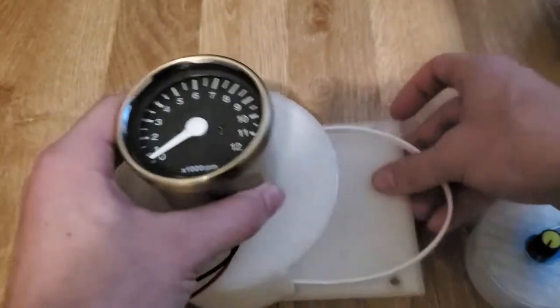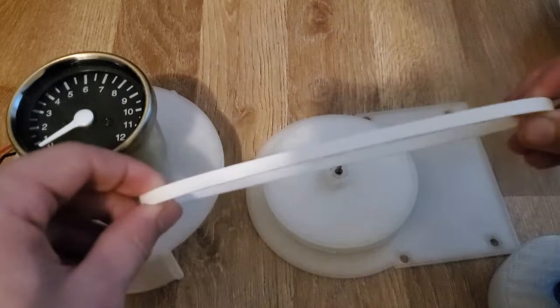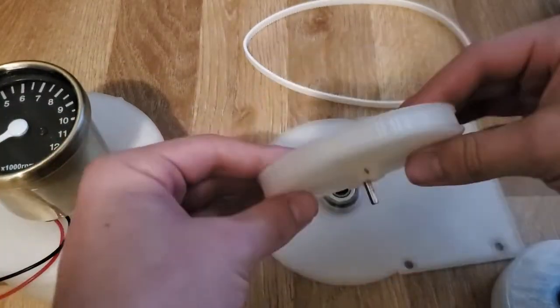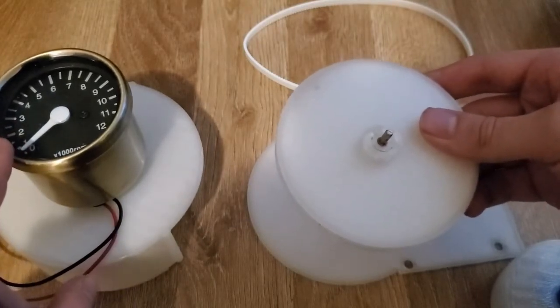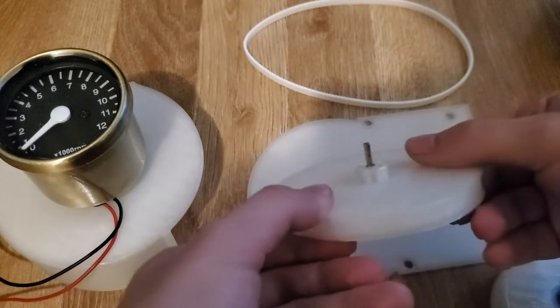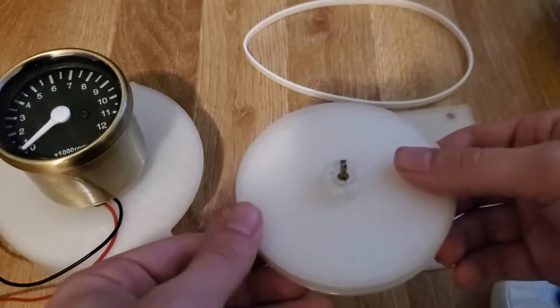And so for this, you can take this apart further. You basically have the belt that I showed. This is TPU, and it actually works quite well. I was quite pleased with this. You have, basically this is the pulley. So this, for whatever reason, is a 1:7 reduction. So when you're getting the readings from the motor, you have to change the gearing. And since the gear on the GT2 pulley has basically 20 teeth, this needs to be 140.